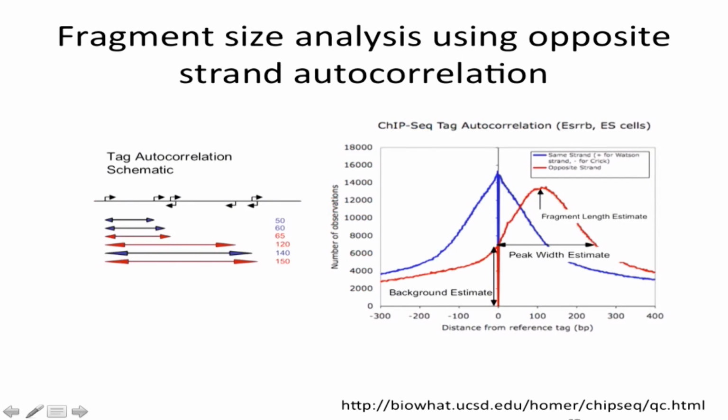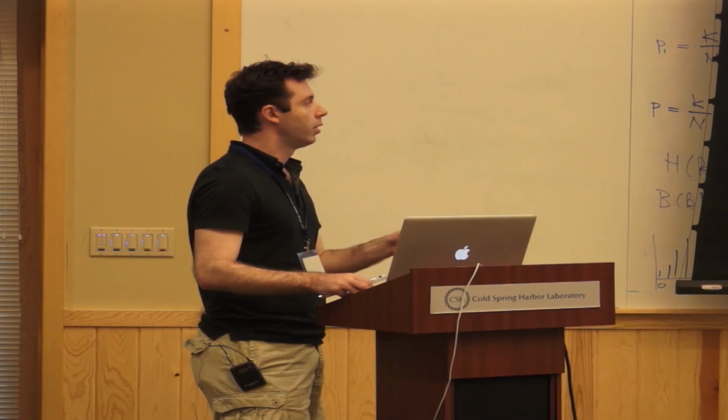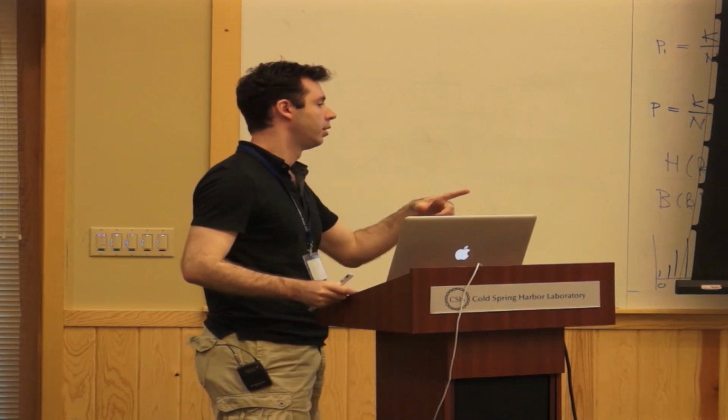That's another story. Compared to the sort of random jumps that you get, do these tend to be more equally distributed between two strands, or is the random jump also equally distributed? So are you talking about whether there's a bias between the strands, or there should be about 50% reads coming from one strand, 50% from the other strand? No, what I mean is where there's a fake peak, does it have the same pattern where they're accumulated sort of in a bimodal distribution, so that you can use that to recognize these things?